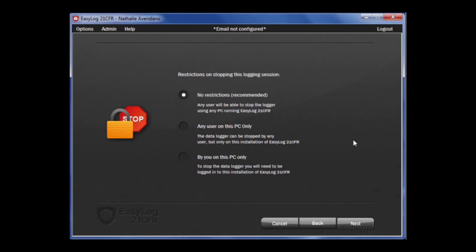On this page, you can decide what restriction you want on stopping this logging session. You can choose between no restrictions, any user on this PC only, or by you on this PC only. This gives you the ability to control who has access to the data. Note that an administrator can overrule the setting if a user's rights do not allow them to stop a logger — they will not be able to regardless of the settings here. Once that is complete, click Next.